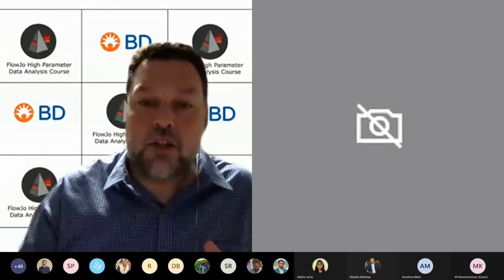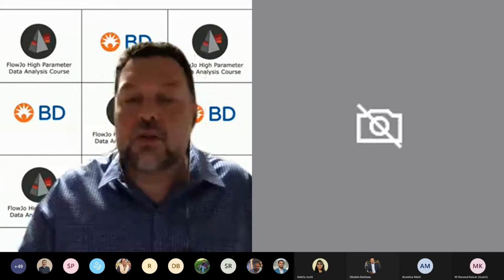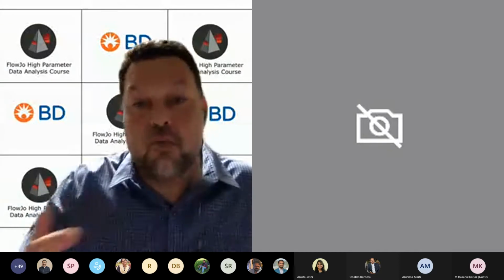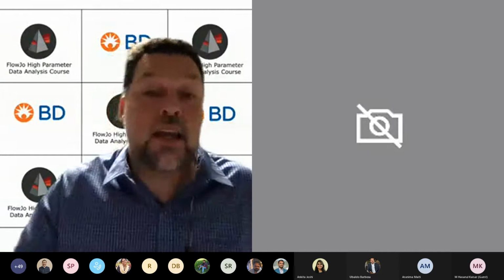Don't be afraid to ask questions. I love interacting and answering those questions as we go through the material. And I'll be switching back and forth between a live demonstration using the software and a presentation.